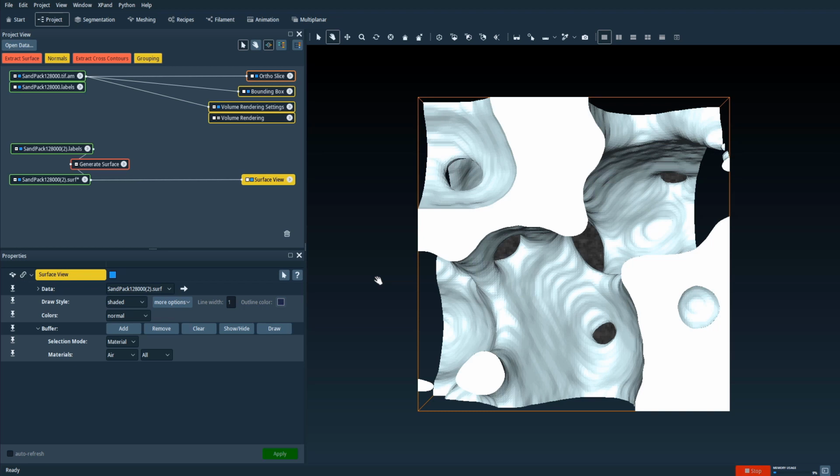And using the VisLabs VR facilities allows you to use Avizo directly in virtual reality with just a few simple steps that I will show in a little bit, and more importantly, without doing any additional coding.